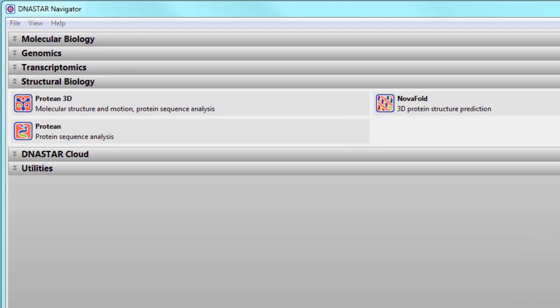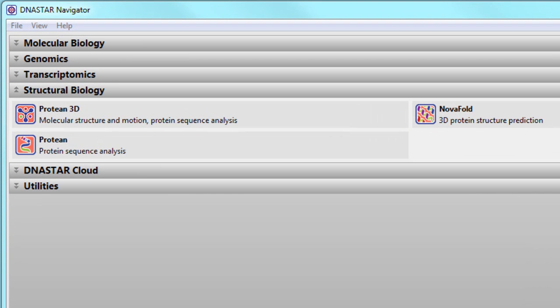LaserGene Structural Biology Suite provides tools for protein sequence analysis, macromolecular visualization, and access to tools for predicting protein structures, protein-protein docking interactions, and antibody modeling.